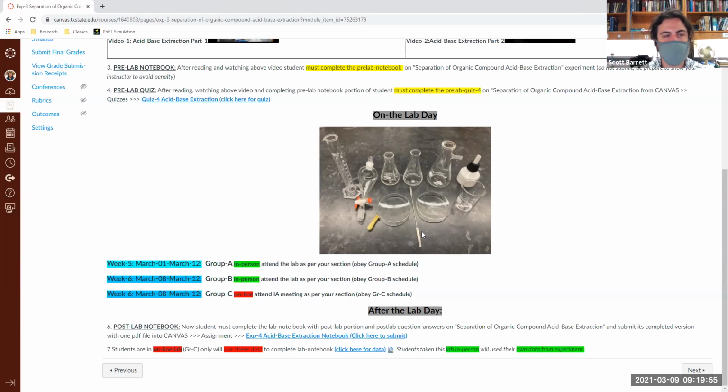You can always utilize Google for glassware if you aren't sure what exactly a piece of glassware is. If you see something and you're not sure, like, what is this flat disc of glass, this watch glass, then you can go online and search glassware, and look through a catalog of common glassware.